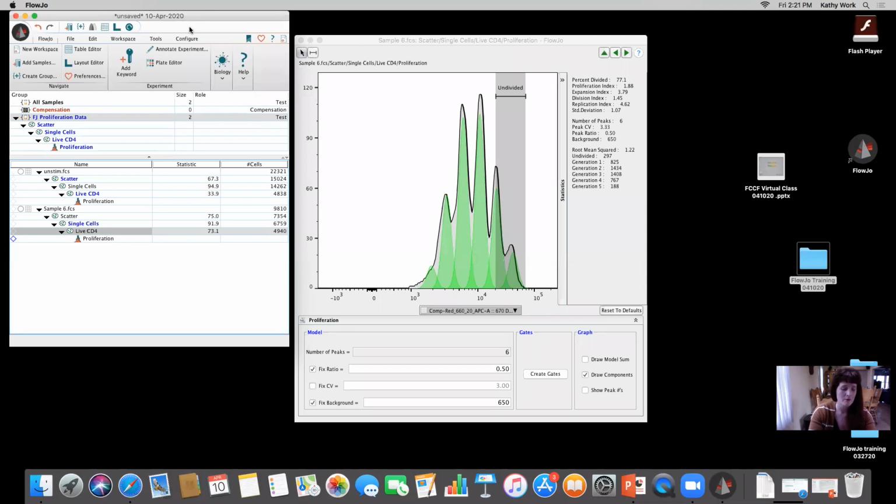Yeah. And my first route of optimization would be to take a look at your titration and see if your cells are actively pumping that dye out, whatever it is. And you might have to look at some reagents or drugs that you can add to prevent that.